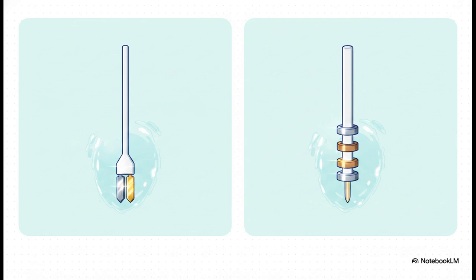It's a pretty straightforward setup where two electrodes sit at a fixed distance and apply an alternating current directly to the solution. Then, stepping it up a notch, we have the potentiometric, or four-ring design. This one is a bit more advanced and is generally your go-to for wider measuring ranges.